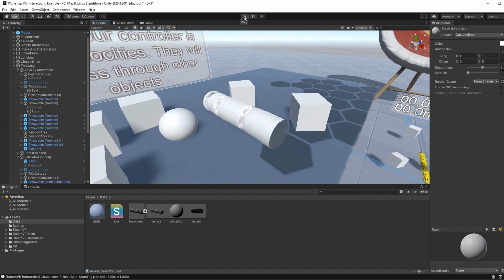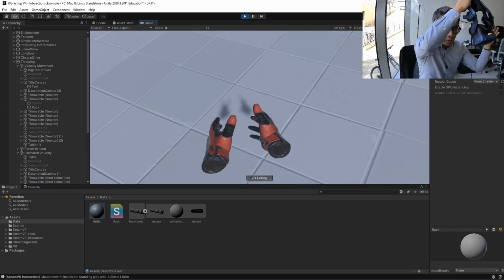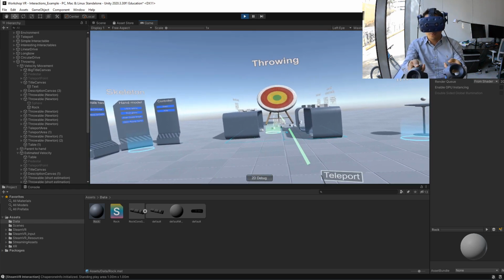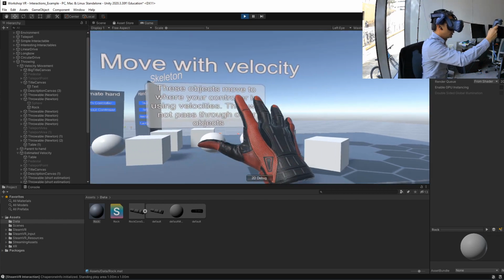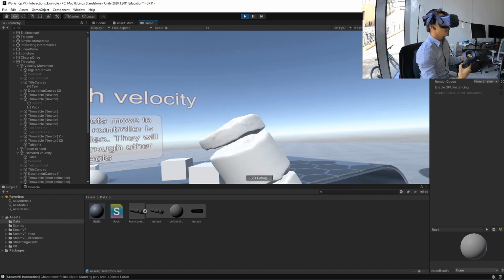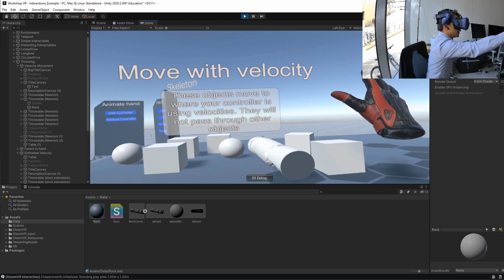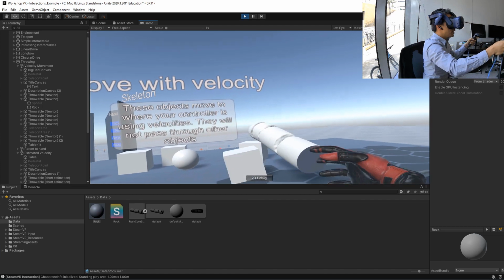If you want, we can go back to VR and have a look at the corrected version. So let me put on my headset again, grab the controllers, and like before, we can teleport close to the table where we have our rock model, grab it and have a look around. And we can inspect it closely. If you imagine this is my virtual lab, I can put my samples all around this table and maybe annotate them or rearrange them somehow.